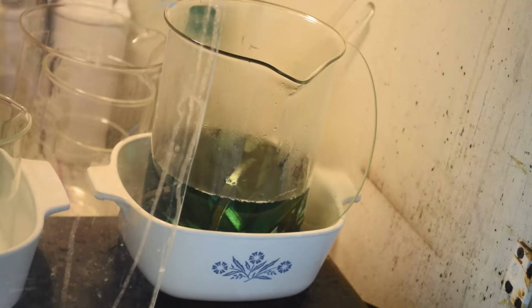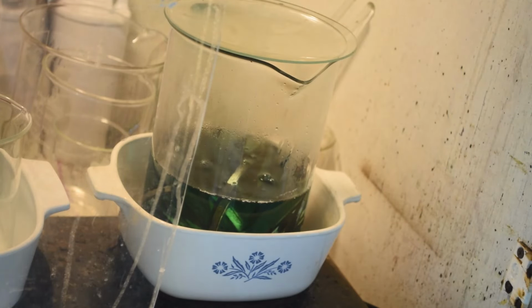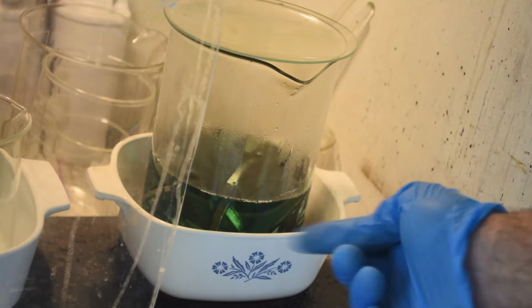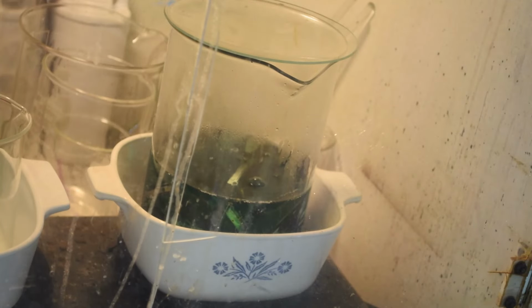Yeah, the bubbling is a lot more vigorous. Okay. So we'll let this go a while longer. Oh yeah, much more vigorous. Okay, good. So we're going to let this go a little while longer because it looks like there's still a lot of that metal on these flexible strips, whatever that metal is. So see if we can dissolve away a little bit more of it. Get the concentration of whatever metal it is in the liquid up a little bit before we do a stannous chloride test on it. So we'll just let this cook for a while.